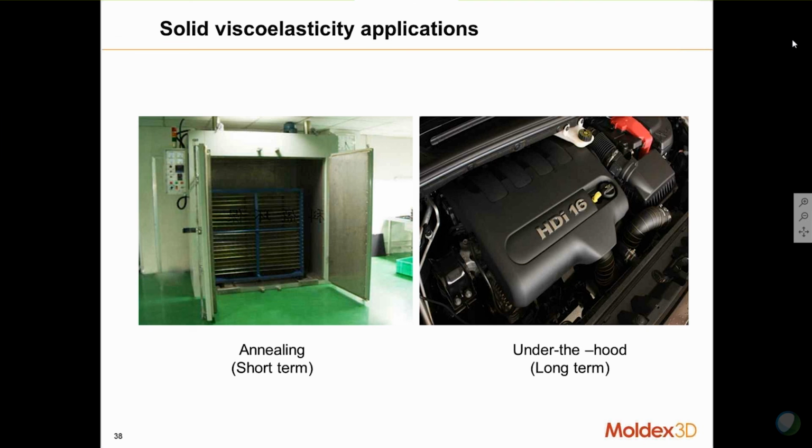Under the hood usage, even though the temperature is not very high, you are subjecting your materials to a temperature environment for a long time. In this case, you want to know the relaxation behaviors because you want to predict its long-term material properties. This is why solid viscoelastic applications are very important.